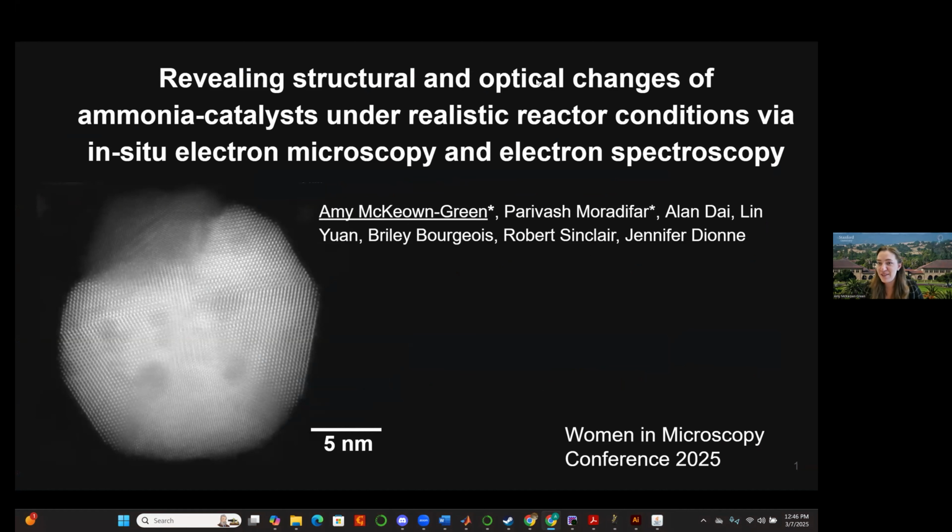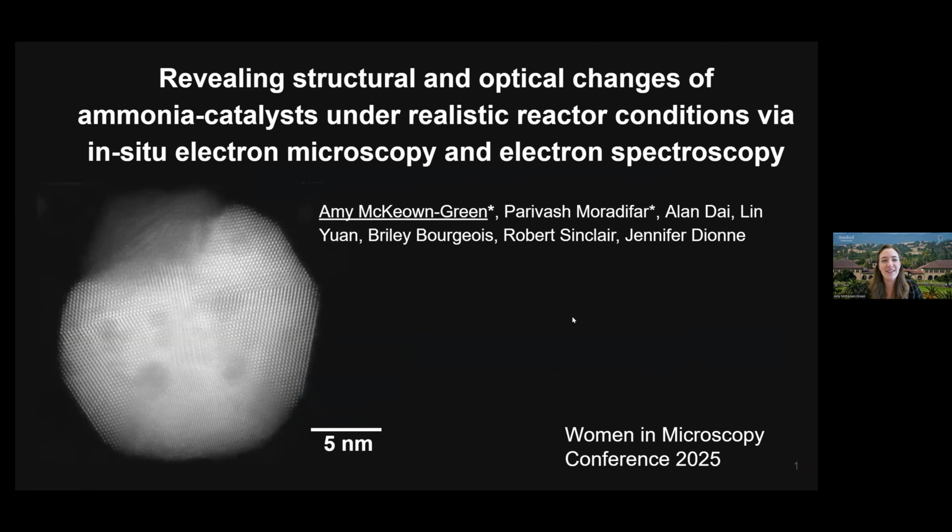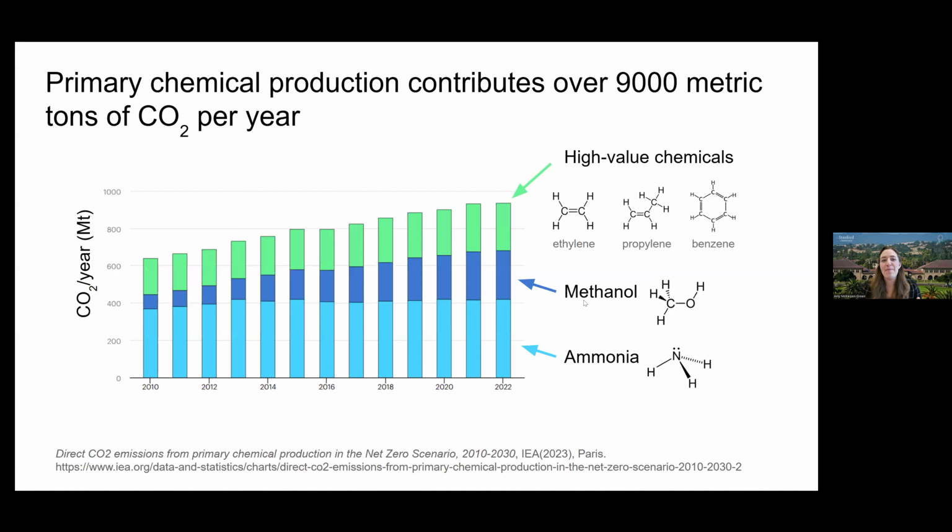Awesome, okay. It's my pleasure to be here today to talk about my work as a member of Jennifer Dionne's group at Stanford University and our work revealing structural and optical changes of ammonia catalysts under realistic reactor conditions using in situ electron microscopy and electron spectroscopy.